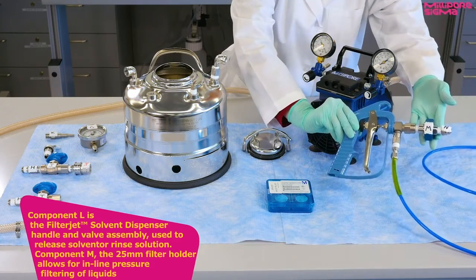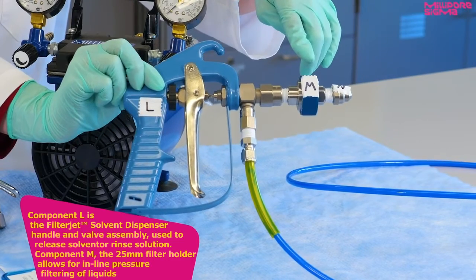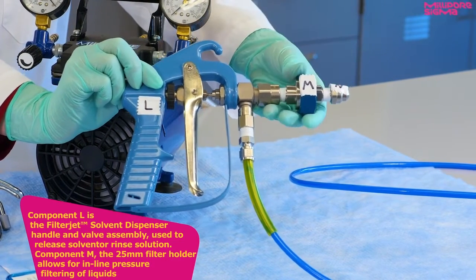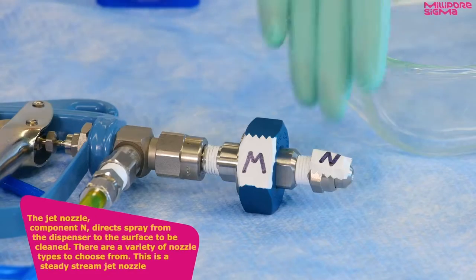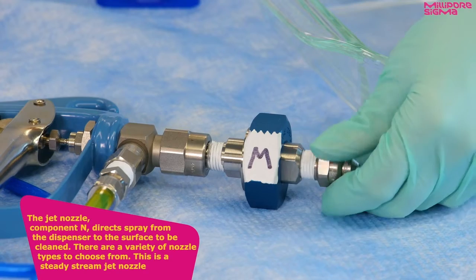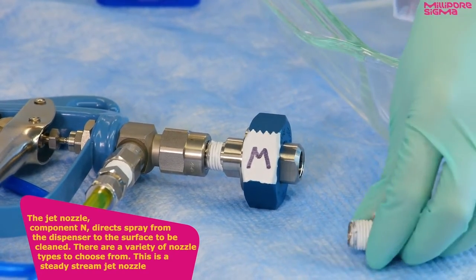Component L is the filter jet handle and valve assembly, used to release solvent or rinse solution. Component M, the 25mm filter holder, allows for inline pressure filtering of liquids. The jet nozzle, component N, directs spray from the dispenser to the surface to be cleaned. There are a variety of nozzle types to choose from. This is a steady stream jet nozzle.